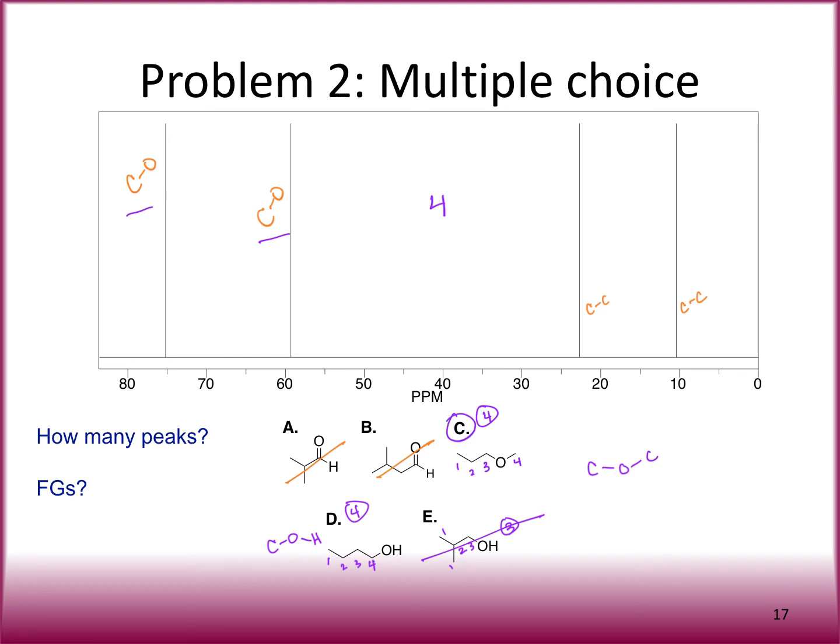And then the last thing we'll do is just double check and draw the structure and see if the peaks match. So let's try to label it. So again, I'm just going to add letters to the peaks just in order. Redraw my structure, and then let's see what matches, all right? So we've got A and B, so those are both CO peaks. So again, if it's really close, I'm not going to make you figure out which one's which. In this case, it's right enough to say that you know there's 2 CO bonds, so that's all you need to worry about.